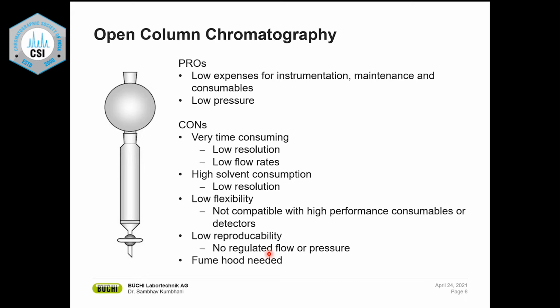However, although it may seem cheap, over the long term, over 5 years, 10 years, it is not cheap. It's not even close, because you spend twice or 4 times as much solvent in an open column compared to a flash instrument. Your quality of separation is not good, so you have to do it over and over again to get really good purity. Your solvent consumption is high. You're not flexible. A person is always stuck in front of the instrument. You cannot do anything else if you are doing open column, and it's not reproducible at all. And you always have to be in a hood to be safe. So there are many cons of doing open column in the long term.